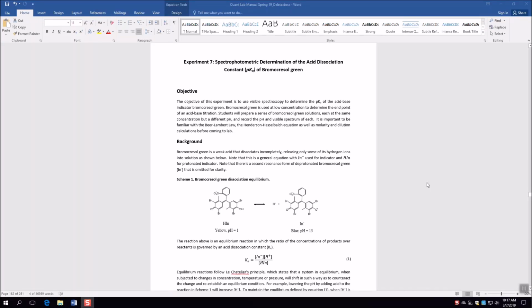Hi everyone. In this video Tim and I are going to go over experiment 7, spectrophotometric determination of acid dissociation constant, pKa, of bromocresol green. You're very familiar with what a pKa is, but you may not be familiar with how to calculate one using spectroscopy. We're actually going to use two methods in this experiment to calculate the pKa of bromocresol green, which is an indicator, and we're going to use spectroscopy to do that.